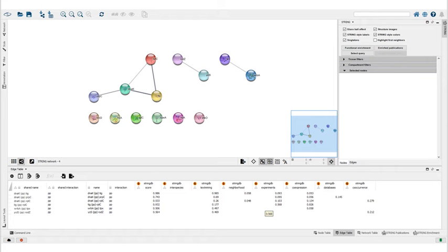String assigns confidence scores to protein interactions based on lab experiments, genomic context predictions, co-expression of proteins, algorithmic text mining, and co-occurrence of proteins, as well as providing publications from Uniprot, PubMed, and others for further reading. String scores can give a useful indication for the potential relationships between proteins, but must be followed up on with further reading, as they don't provide a directional basis of the relationship.